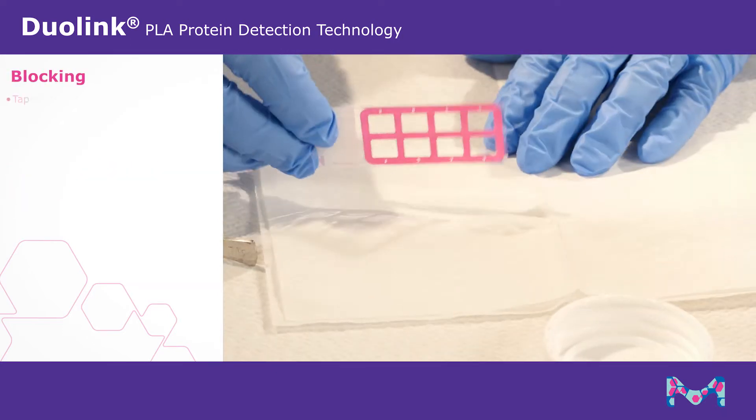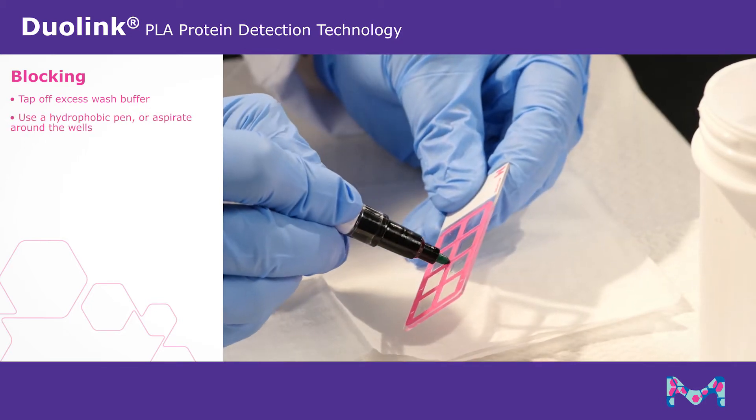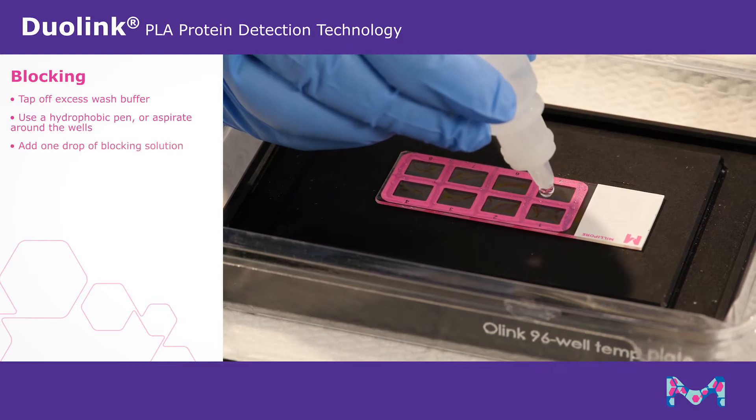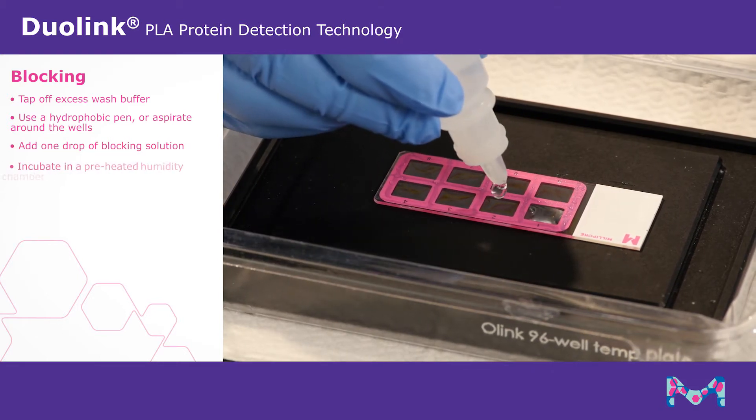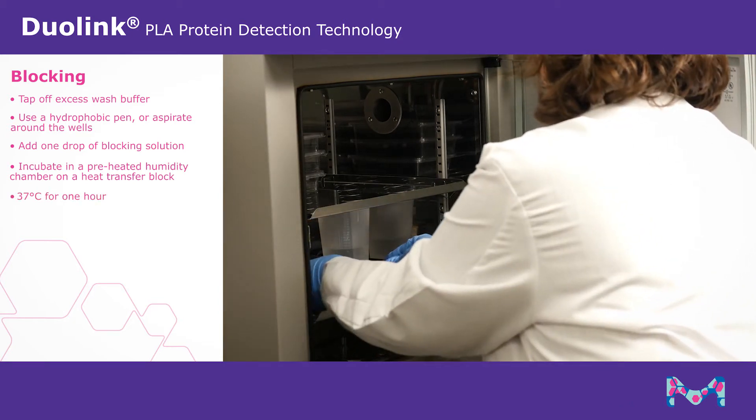When you are ready, tap off excess wash buffer and use a hydrophobic pen or aspirate around the wells. Add one drop of blocking solution per well and incubate in a preheated humidity chamber on a heat transfer block at 37 degrees Celsius for one hour.